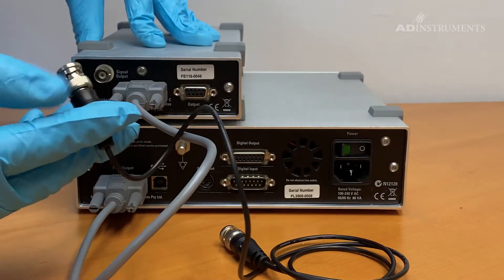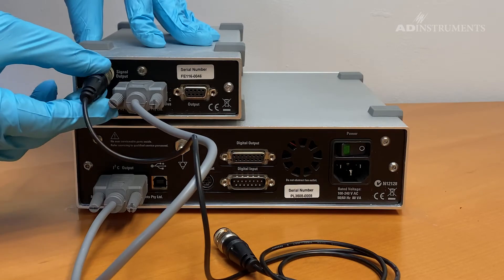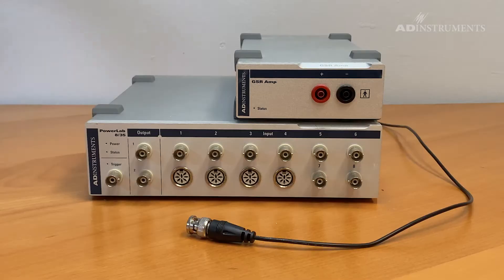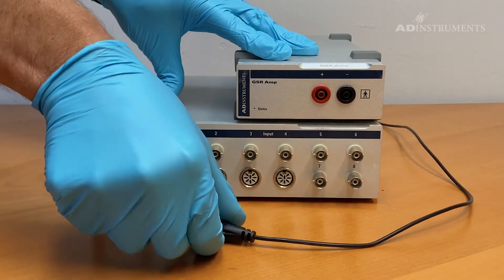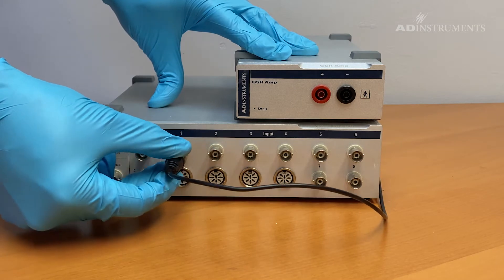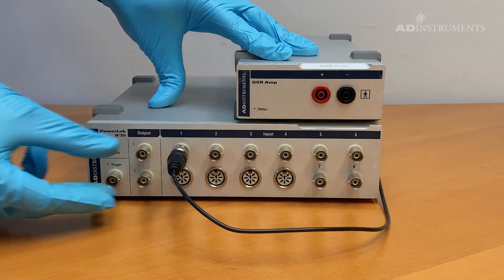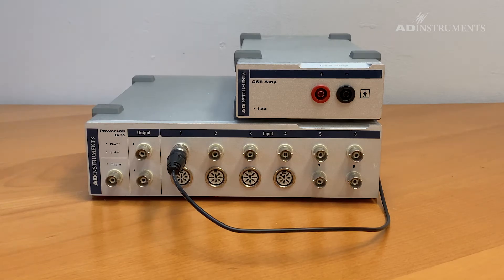Also connect the BNC cable to the signal output on the back of the GSR amp. Connect the other end of the BNC cable to one of the channels of the PowerLab, keeping in mind that LabChart will recognize the GSR amp on the channel that the BNC cable is connected to.